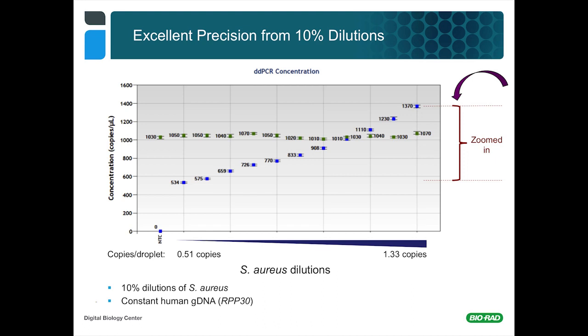And what you can perhaps see, I hope on your screen, is that on each of those markers there are a couple of little end caps to 95% confidence intervals that actually don't even extend beyond the size of the marker, which means that with 95% confidence, your true concentration falls within the concentration shown by that blue marker. And you can see that if those confidence intervals do not overlap with the next adjacent one, you can distinguish those 2 measurements, and they represent probably 2 distinct concentrations with high certainty. So you can see here that you can make very, very high precision measurements.